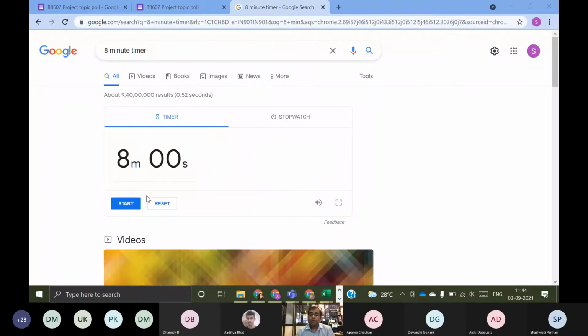Also, sometimes your protein extracts can only be in a specific type of buffer, which may not be completely compatible. Like you have too much high SDS in your sample prep. Like if we are trying something on FFPE, for example, and it requires a lot of SDS. Then if too much detergent is there, that is not going to be compatible for the LCMS analysis.